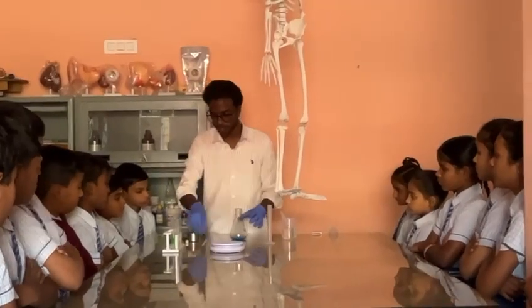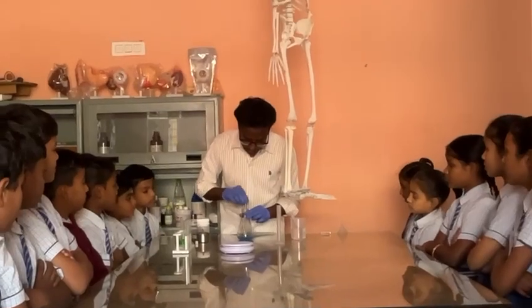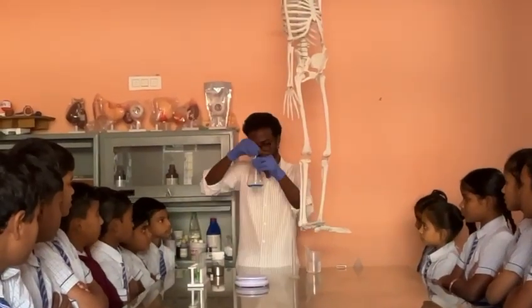With the help of what is this? Glass rod. I am going to dissolve the copper sulfate.